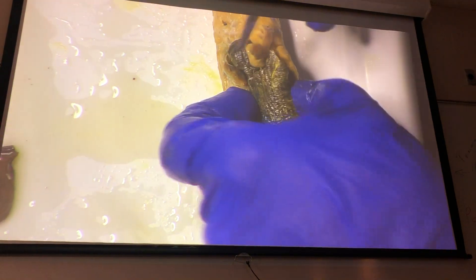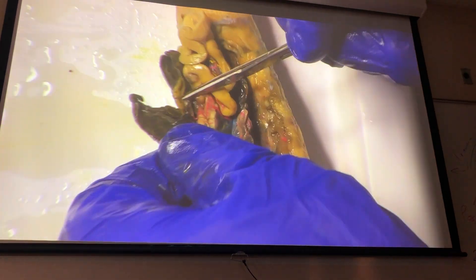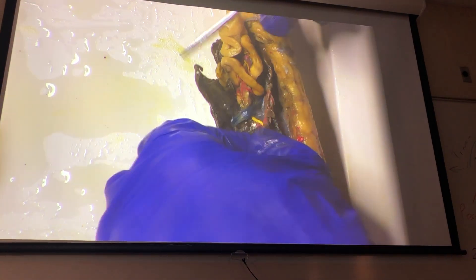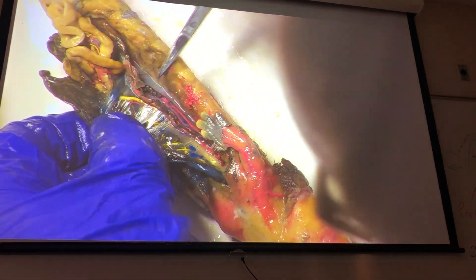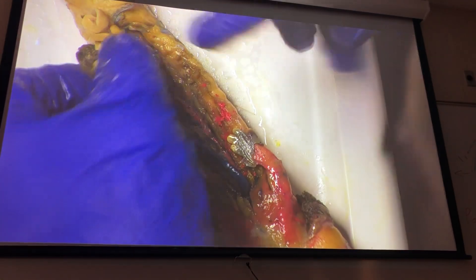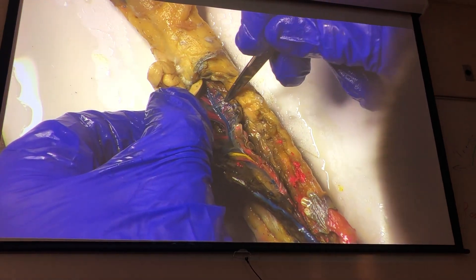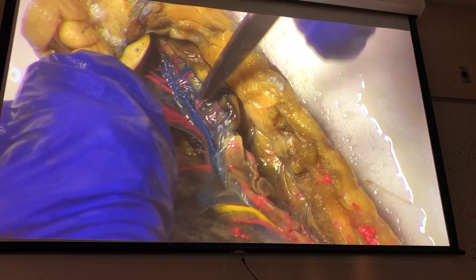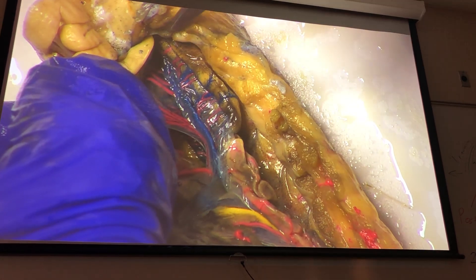Here we can see the liver. At the end of the liver, you've got this little deflated balloon — that's the gallbladder. Here we can see the lung of your mud puppy, and that lung is going to be another thing to separate out. Next to it, kind of looking like a piece of calamari, are the mesonephric ducts. This being a little boy, down here is his testicle. You'll see a gray thing between the post-cava and the testicle, with a lot of little blood vessels in between — that gray thing is the kidney, the mesonephric, or if you prefer, opistonephric kidney.